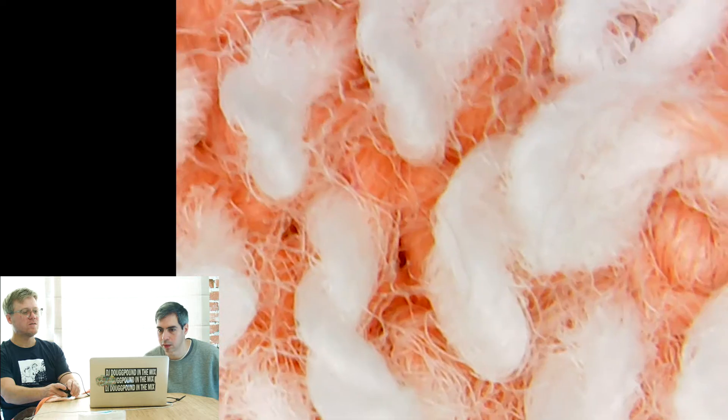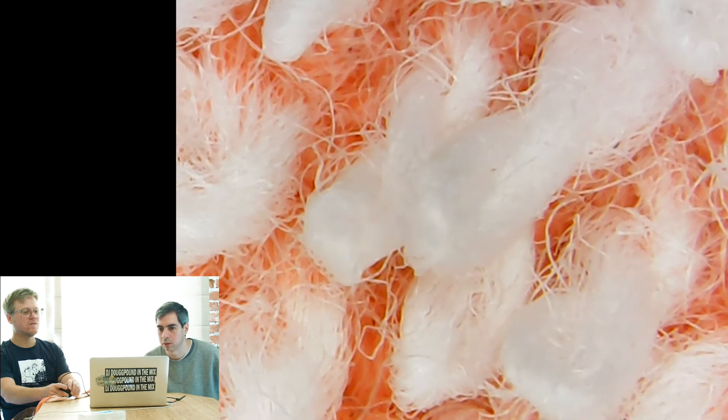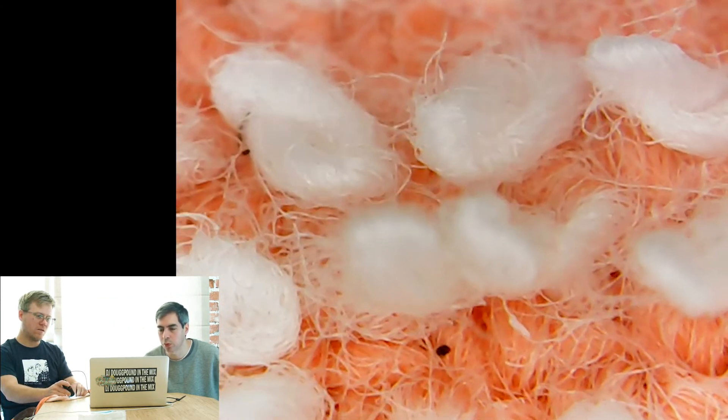Look at these loops. Now, yeah, that's interesting. I think that's worth looking at. We haven't seen this before. I never knew — I can't see with the naked eye that they were actual loops. I thought they were just little strands of sorts. Didn't know they were loops.